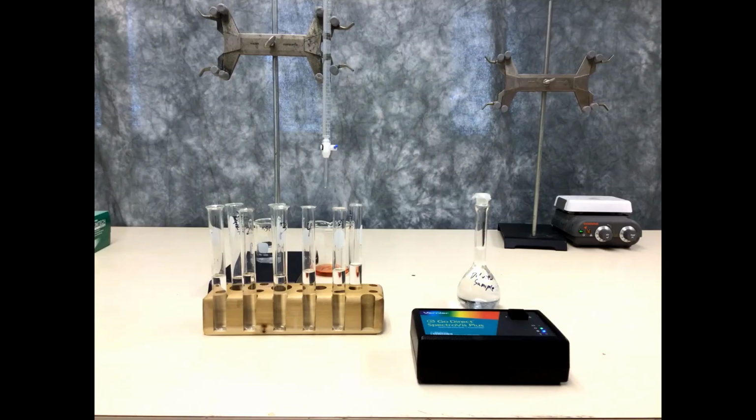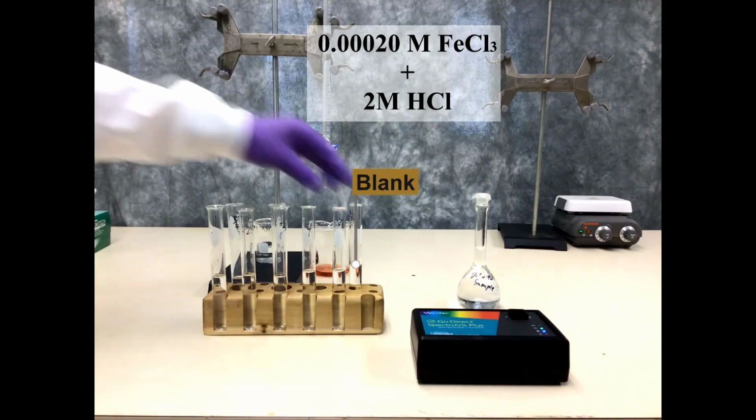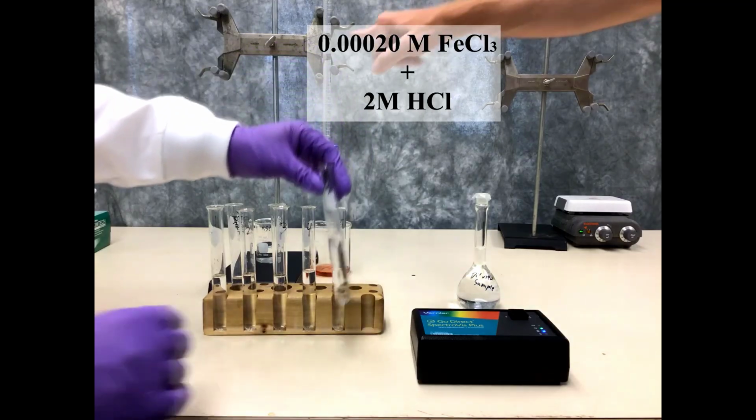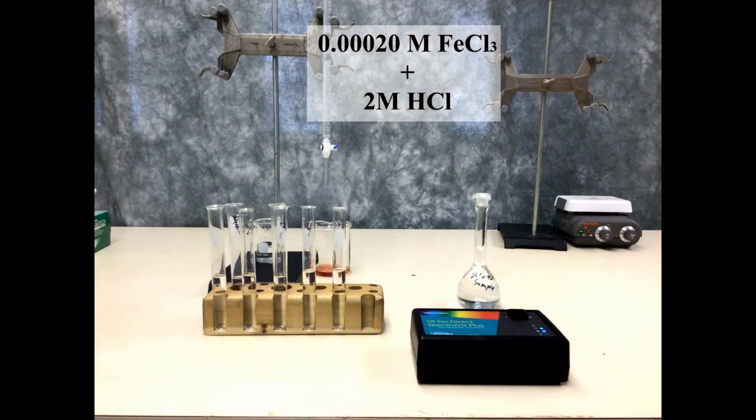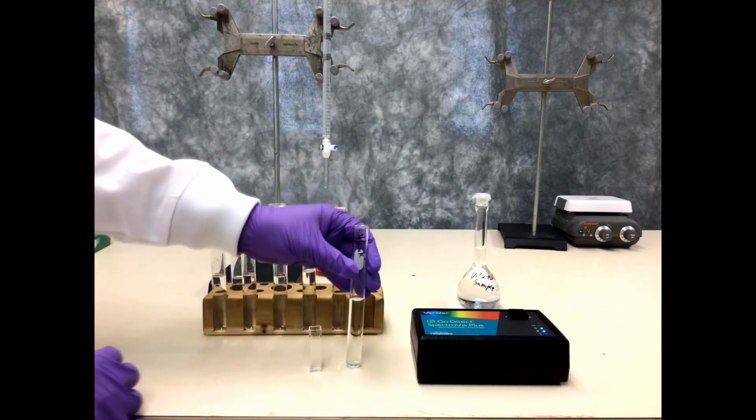We're going to first calibrate our spectrometer with a blank. The blank will have a solution of iron chloride, FeCl3, so this is iron 3+, along with some HCl, hydrochloric acid. The one part that the blank will not have is any thiocyanate. Potassium thiocyanate, KSCN, is in our burette here, but we are not going to add this to our blank. We just want to make sure there's no color due to the iron and hydrochloric acid. As you can see, it looks pretty clear. We're going to add a little bit to our cuvette and use it to calibrate our spectrometer.